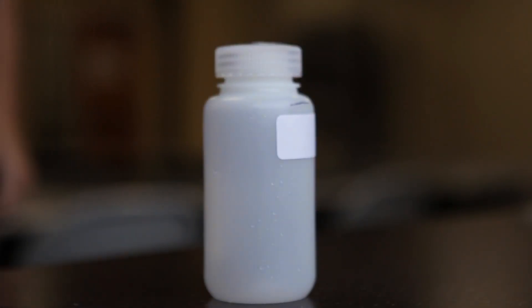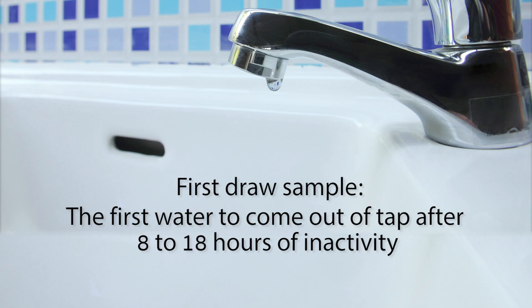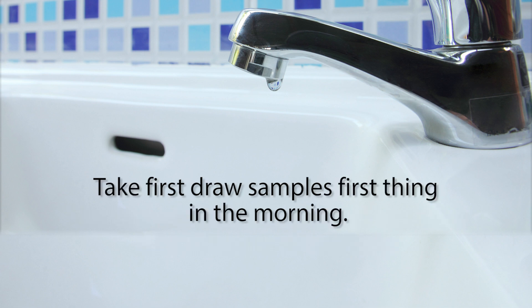For each sample, you'll use a 250-milliliter plastic bottle that was sent to you from the laboratory. You'll start with a first-draw sample — the first water to come out of the faucet or fountain after 8 to 18 hours of inactivity. It's easiest to take this sample first thing in the morning before you start using the water for the day.